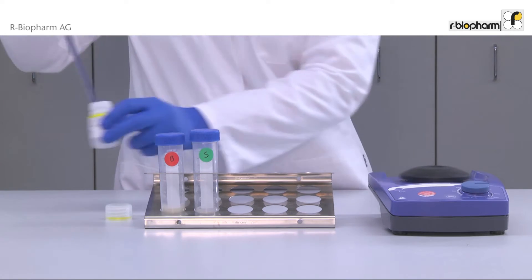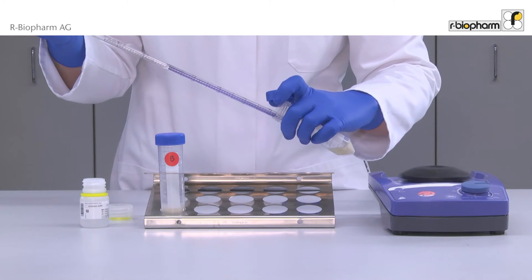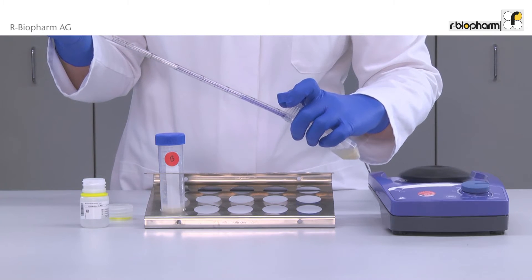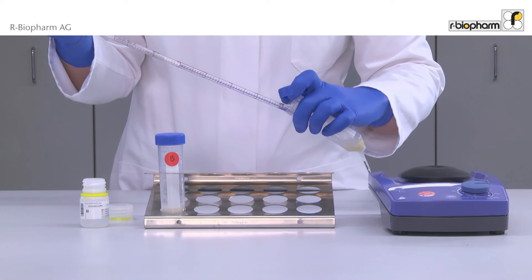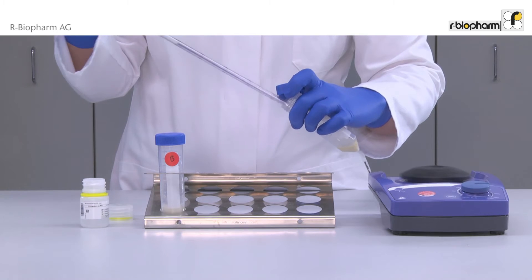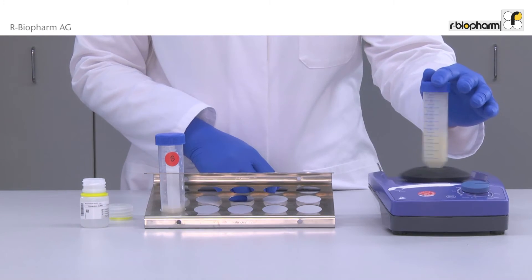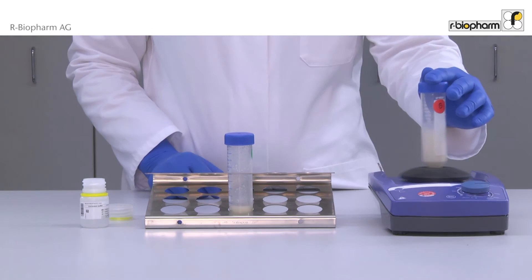Avoid cross-contamination — use a new pipette for every sample. Then mix the food sample thoroughly to dissolve the whole sample.